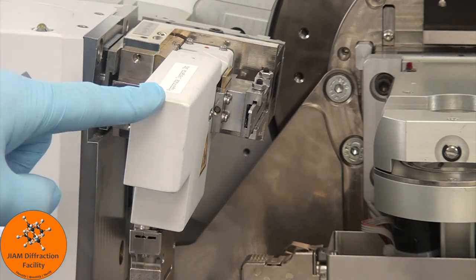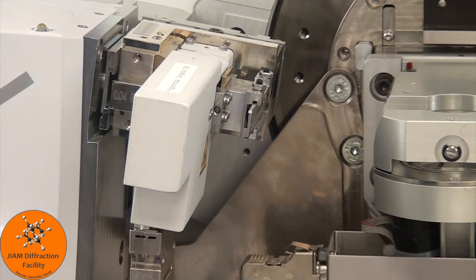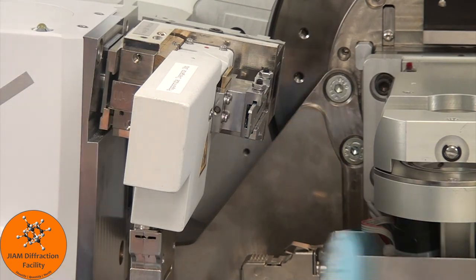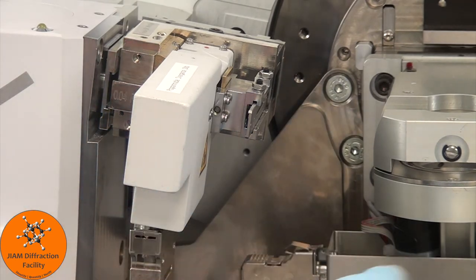Next, we have the programmable divergence slit, which is also the prefix module for the incident beam side. I can't show you the divergence slit itself because it is contained within this enclosure, but I can tell you that it controls the height of the X-ray beam, which in turn determines the length of your sample that is irradiated. And length is this way, left to right. So a smaller slit means that you have less sample that is irradiated left to right.